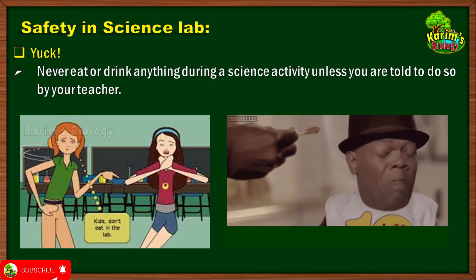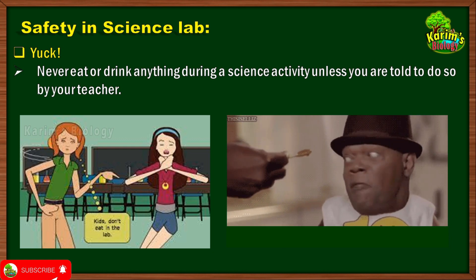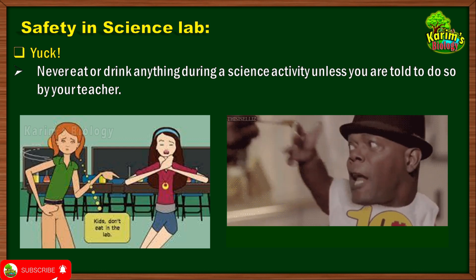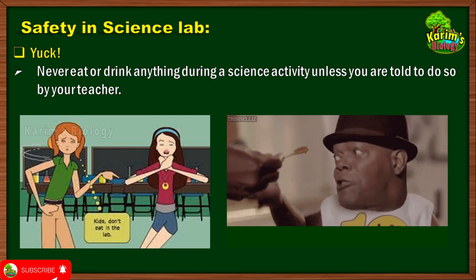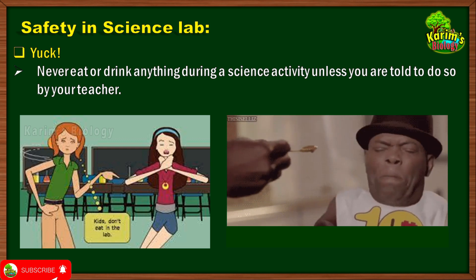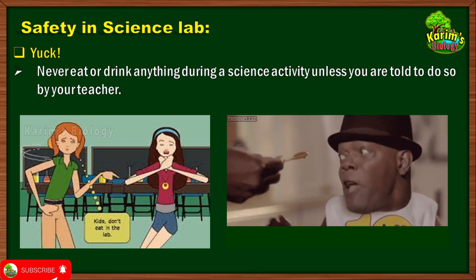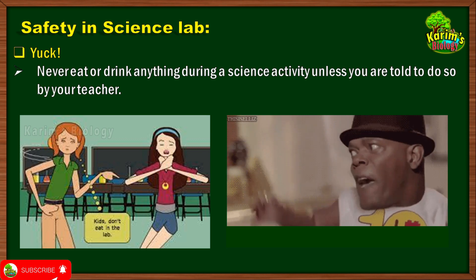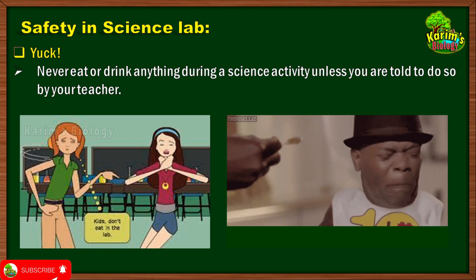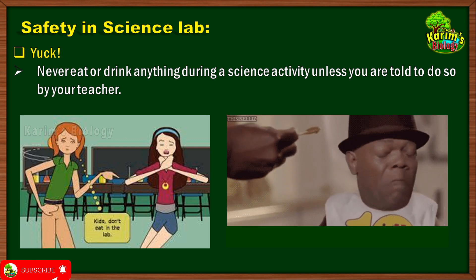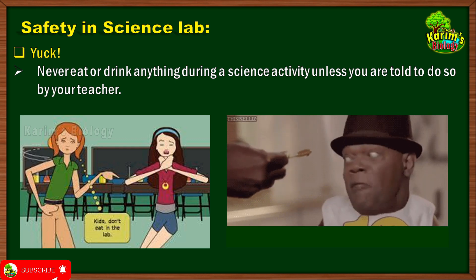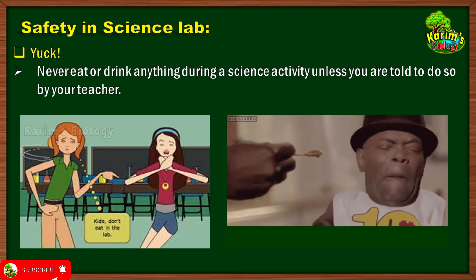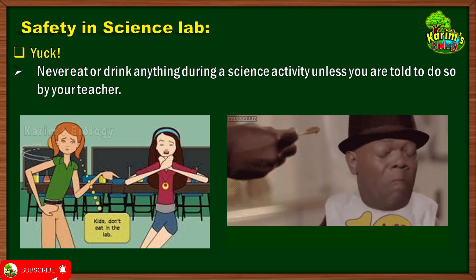The next safety rule in the science lab is: never eat or drink anything during a science activity unless told to do so by your teacher. You should also not smell anything in the science lab unless your teacher asks you to. Your hands may be contaminated with chemical compounds or microbes, and eating with contaminated hands could allow those substances to enter your body and cause disease. Concentrated acids such as concentrated sulfuric acid and concentrated hydrochloric acid are dangerous even when you smell their fumes, as the fumes can damage your nasal cavity.